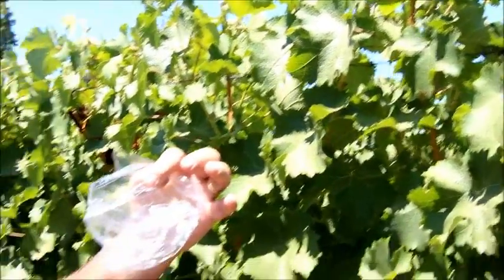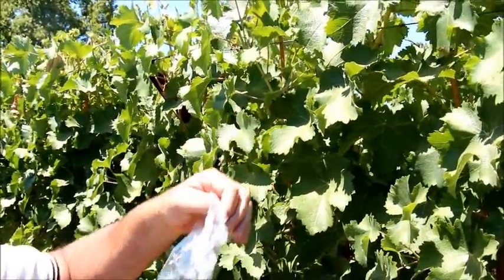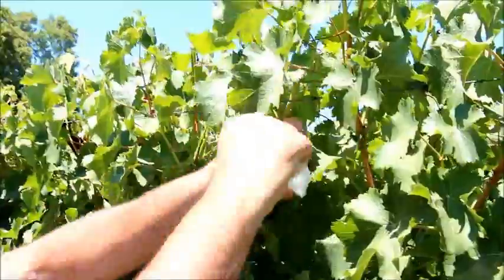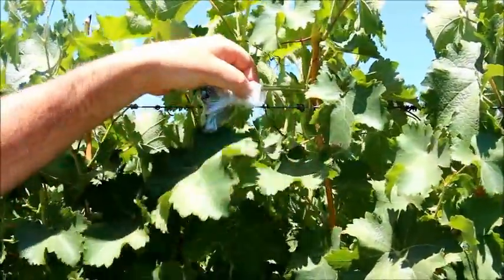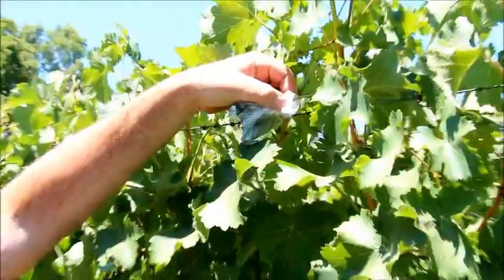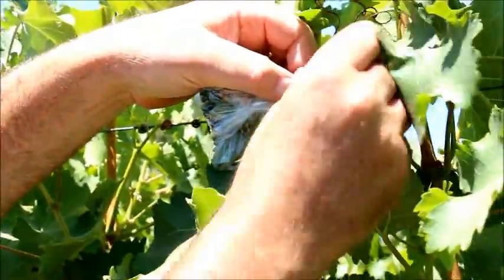Yes, the idea is you take a leaf sample and get it back to the chamber within 30 to 60 seconds. We take a regular sandwich bag, fold the leaf inside of the bag, take a razor blade, and slice the petiole off.